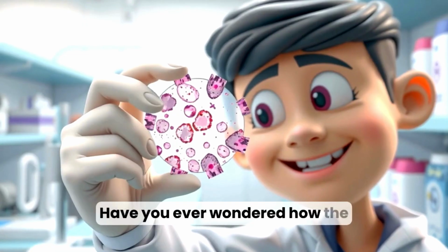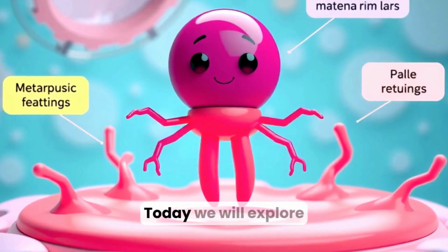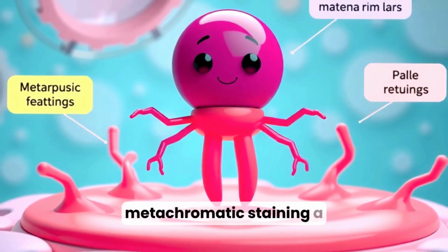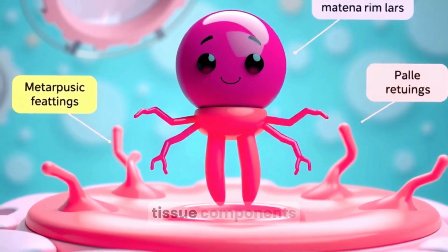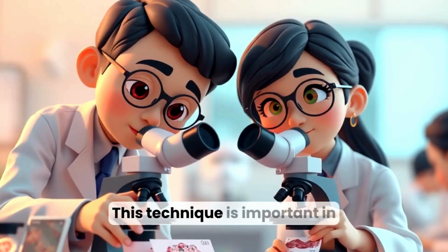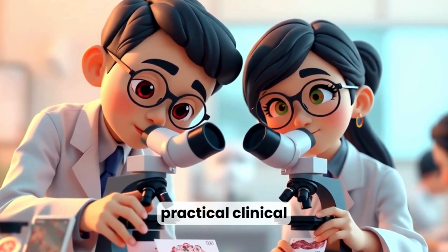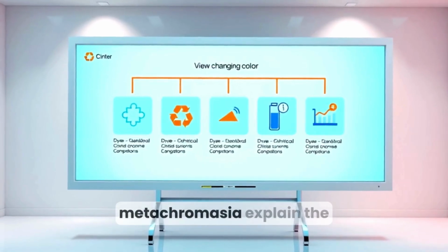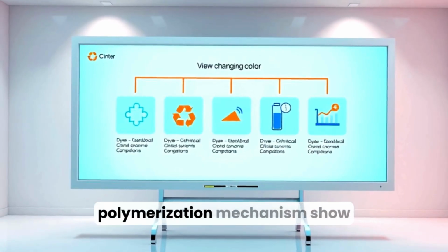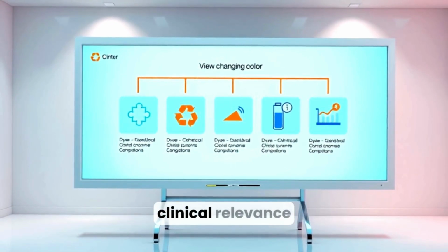Have you ever wondered how the same dye can produce different colors and tissues? Today, we will explore metachromatic staining, a phenomenon that changes dye color when it binds specific tissue components. This technique is important in histology and cytology and has practical clinical applications in diagnostics. In this video, we will define metachromasia, explain the polymerization mechanism, show visual examples, and summarize clinical relevance.